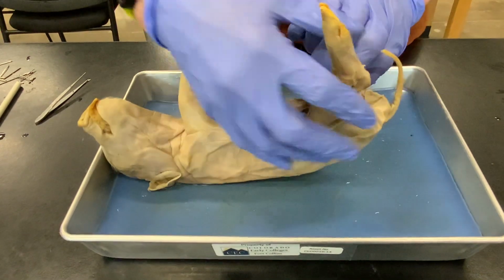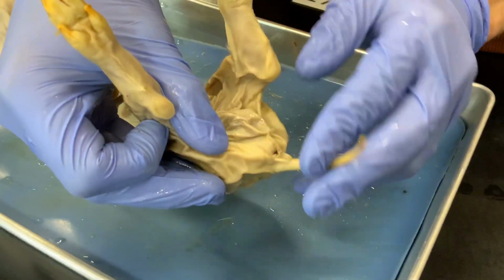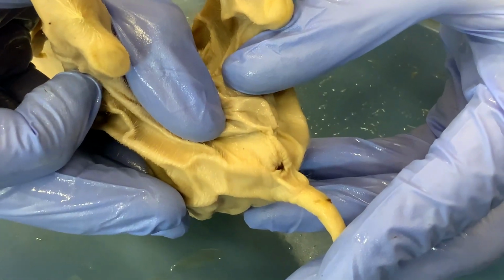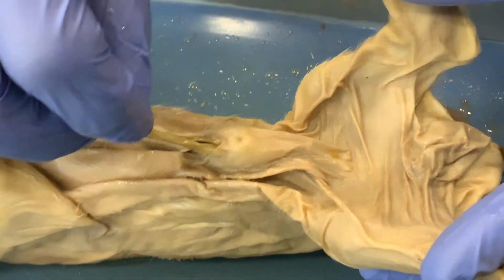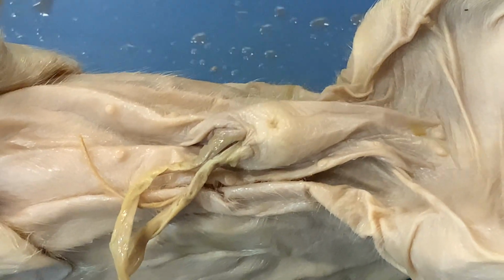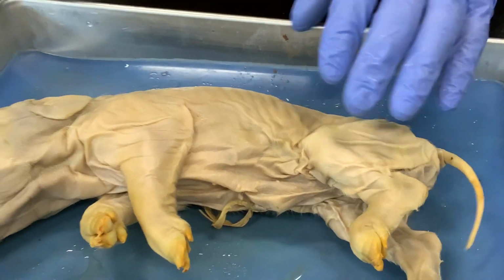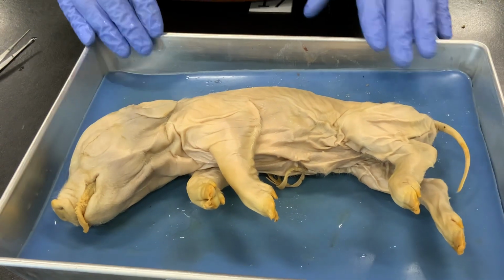So on this one, if you look back, there's the anus. There's not another opening in front of that. And up here by the umbilical cord, that is the urogenital opening right here. So this is a male pig, and that is how we identify the gender of a piglet.